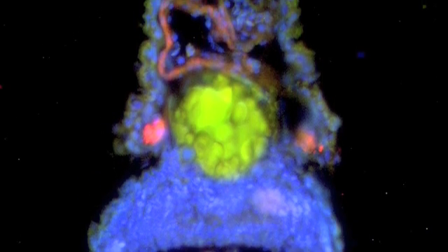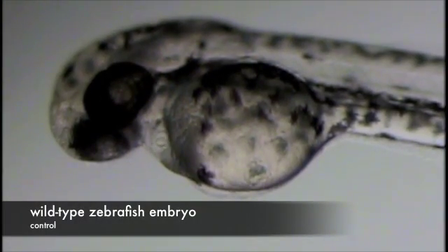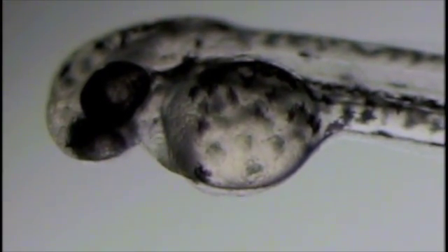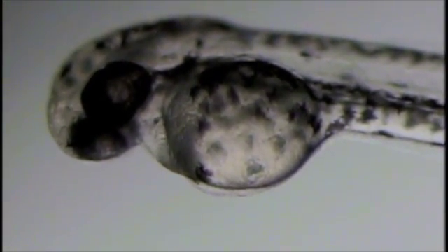We have also adopted morpholino technology within our lab to inhibit genes that we find to be expressed in the heart. Shown here is a wild-type zebrafish embryo. Note the vigorous contraction of the healthy heart.